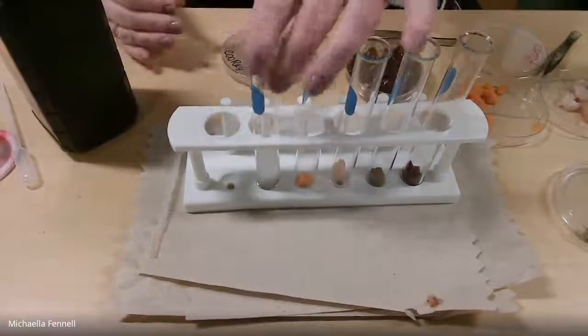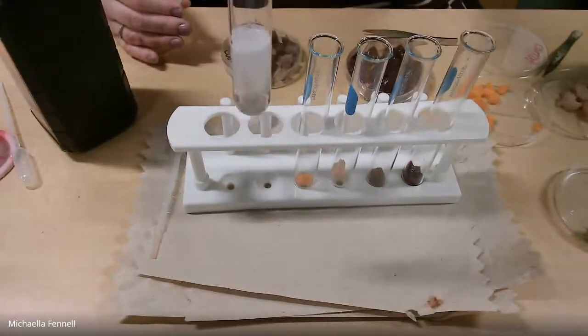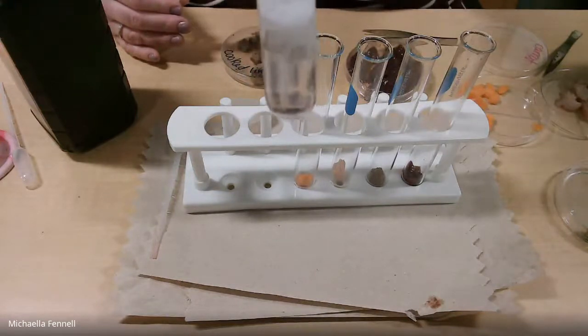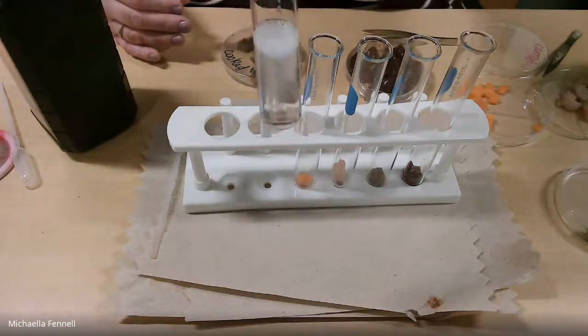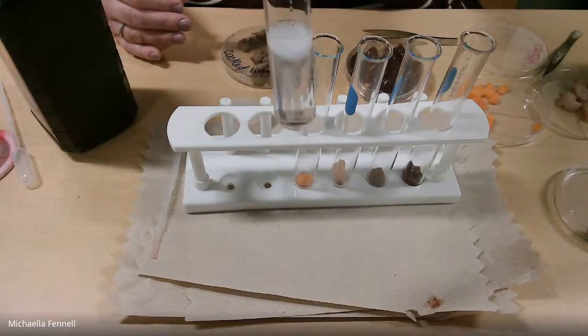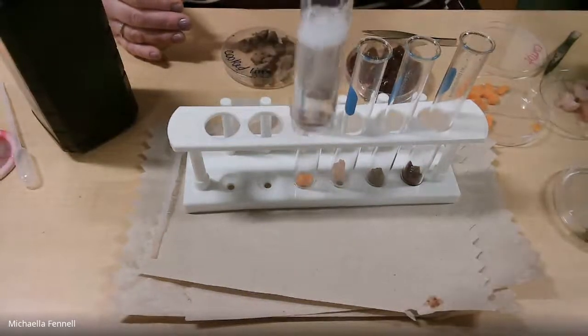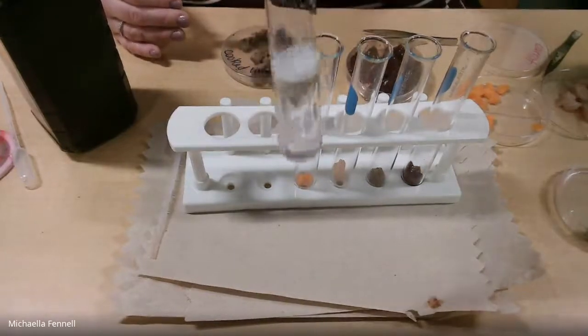And hopefully you can see that. We got some fizzing, and actually a fair amount of catalase. I don't know if you can see that close up. There's little bubbles forming on the surface of the potato. It's kind of fun to watch. At home, if you have potato and hydrogen peroxide, go ahead and cut a little chunk up, put it in a little container, and pour some hydrogen peroxide on it, and you can see how it reacts.